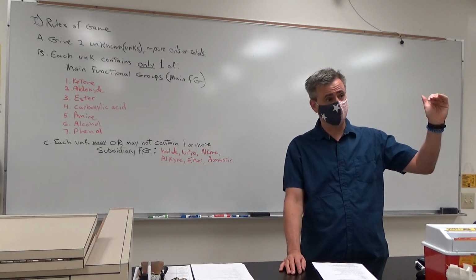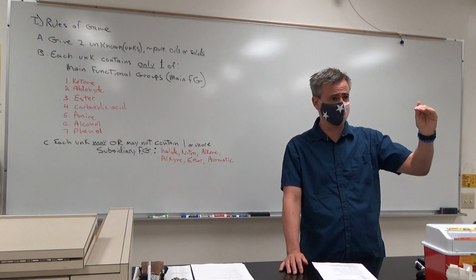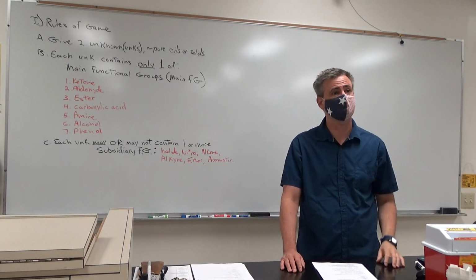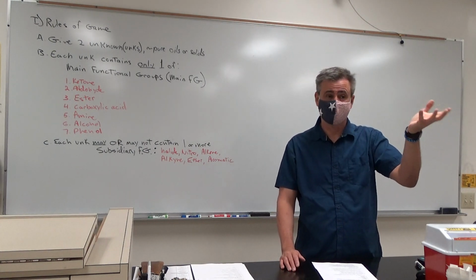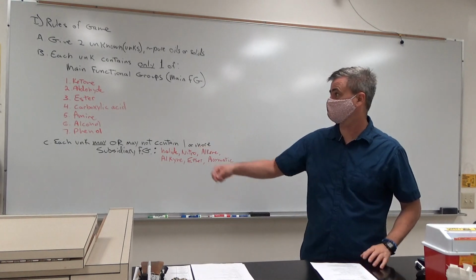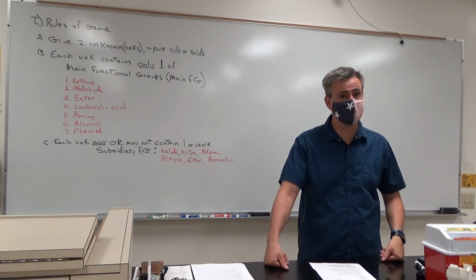If it's not soluble in water, then you're going to move on to concentrated hydroxide. If it's soluble in concentrated hydroxide, at that point, you have very good indication that it's either a carboxylic acid or a phenol. It wasn't soluble in water, but once you put it in hydroxide, it was soluble, which means it got deprotonated. It became anionic, and that's why it likes to be in water now. The only two things that are possible out of those groups that can be deprotonated by hydroxide are phenols and carboxylic acids.